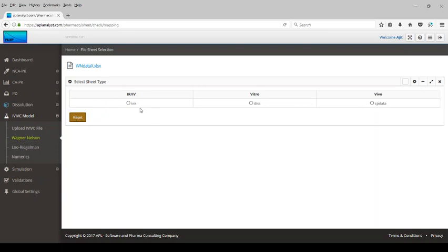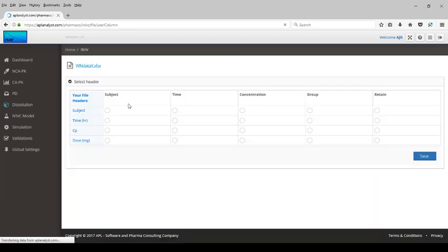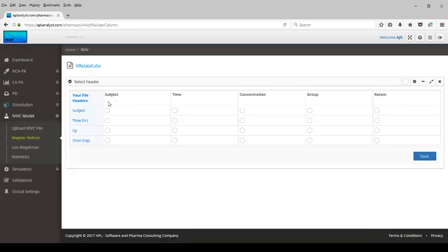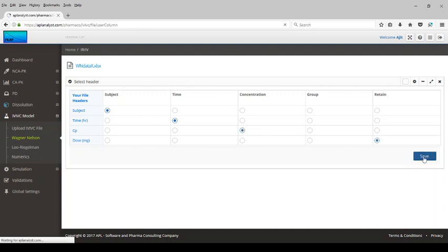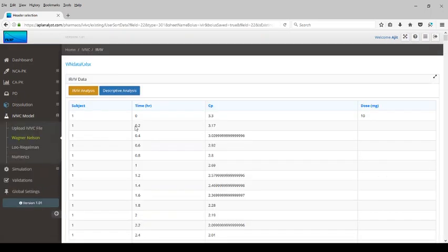We will reset it. First, we will compute the disposition parameters for the subjects in the dataset. We will do the mapping of the file headers with the program-required headers. In this case, subject is subject, time is time, CP is concentration, and we will enter the dose. We will save this and the data will appear.